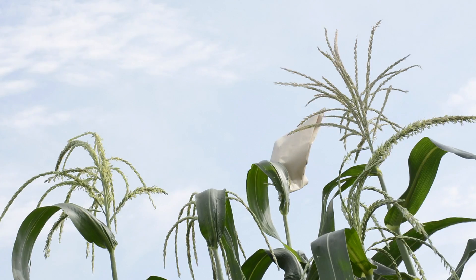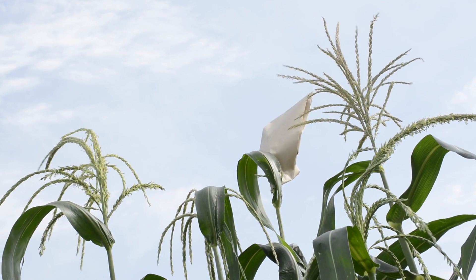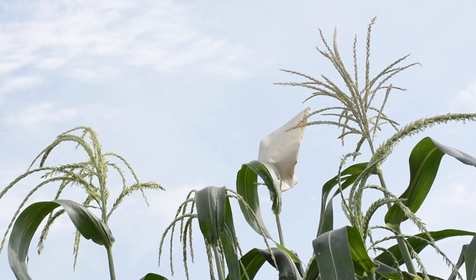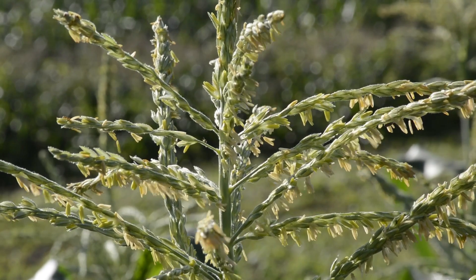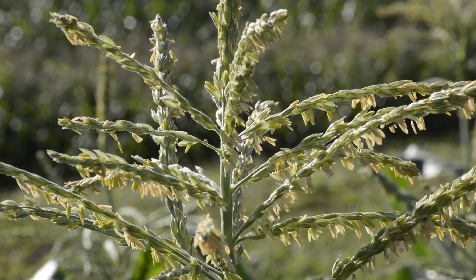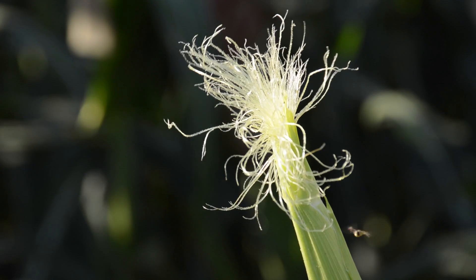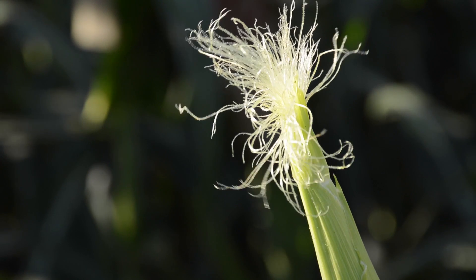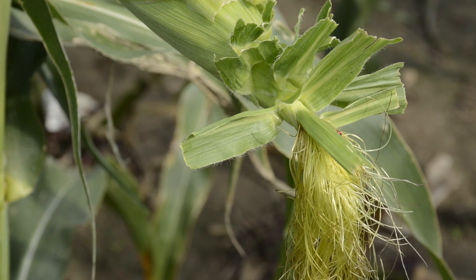The corn plant is a cross-pollinating species. It has two parts. The tassel contains the male parts — these little pollen sacks on top. You can see these little fringes hanging out. They contain pollen, and the wind can blow the pollen anywhere from dropping it on the same plant to half a mile away. The silks are the female part and they have little tiny hairs that collect the pollen. When we make pollinations, we want to control what pollen lands on the silk.